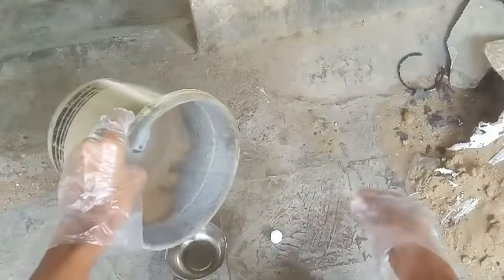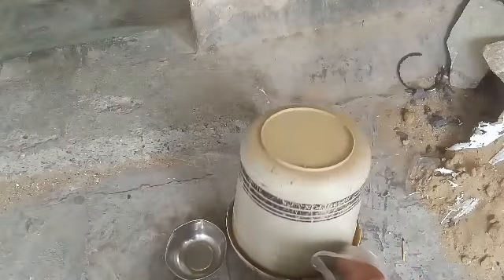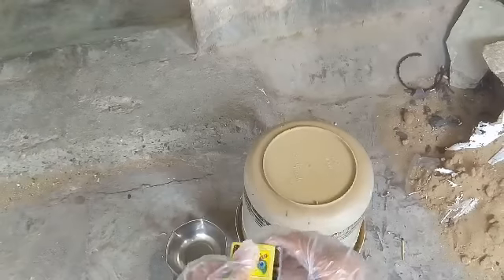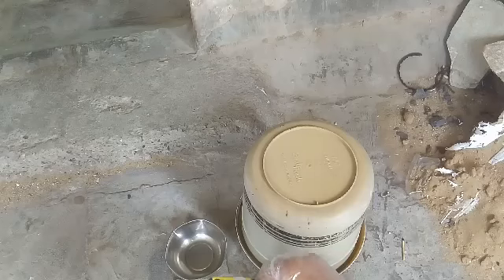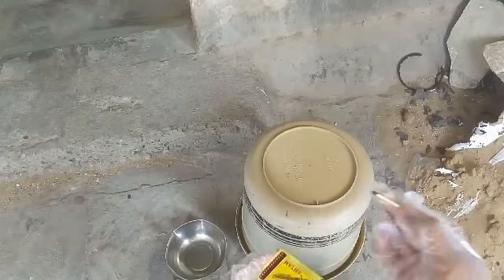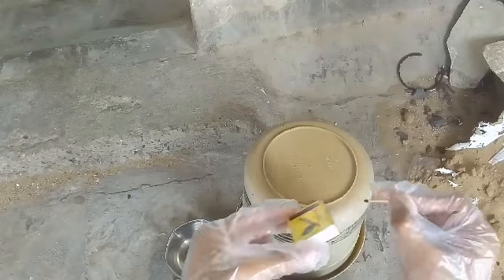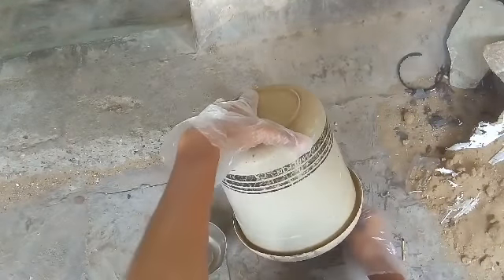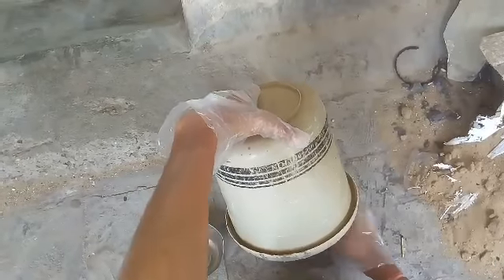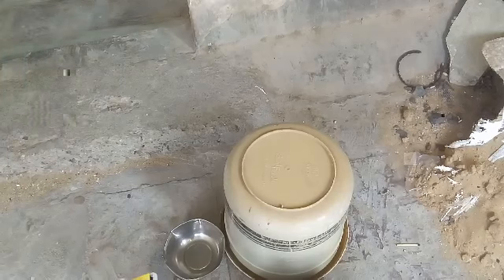So you can see it's hard to ignite the match here. So what I'm gonna do first is to cover this. I'm sorry you will not be able to see this, what will happen, but for the fire to start I have to do this. So get a match, ignite it, and immediately I place it here in this container and I try to ignite the naphthalene balls, right? So when it will ignite, I'll be back.